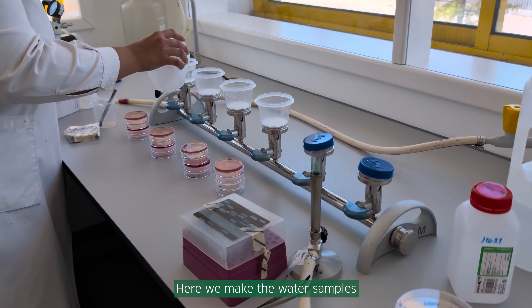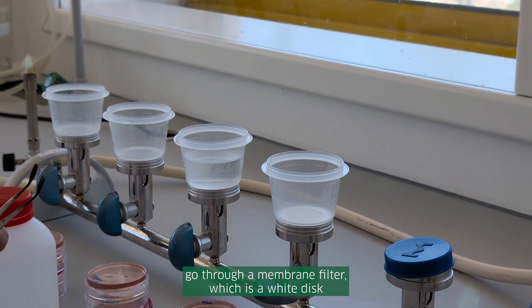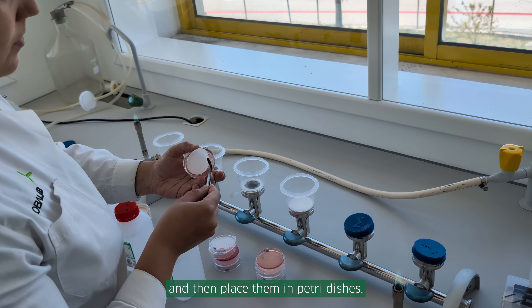Here, we make the water samples go through a membrane filter, which is a white disc that will capture any microorganisms, and then place them in petri dishes.